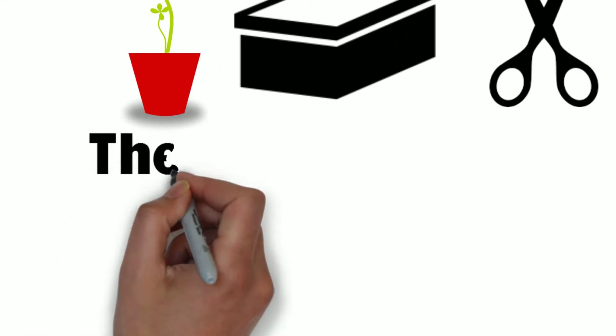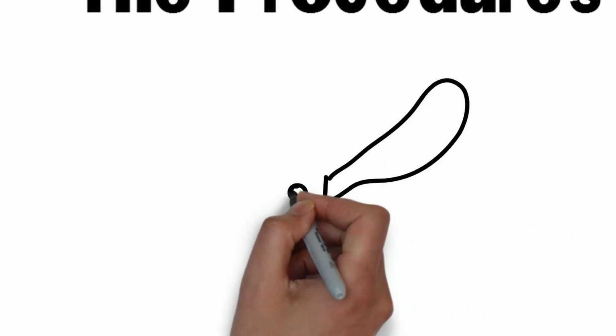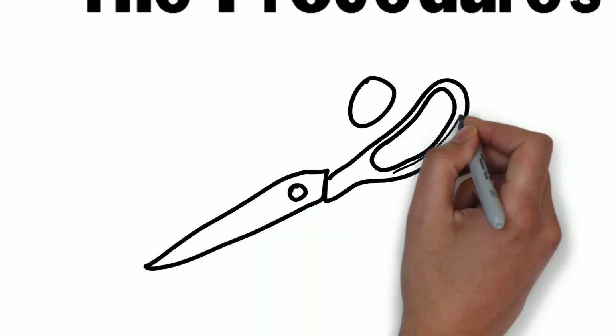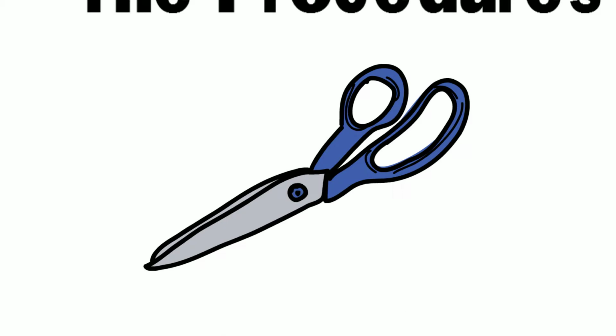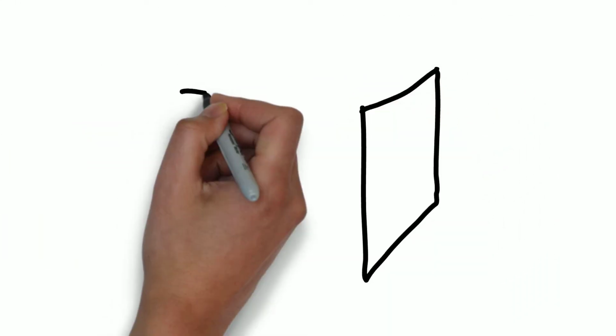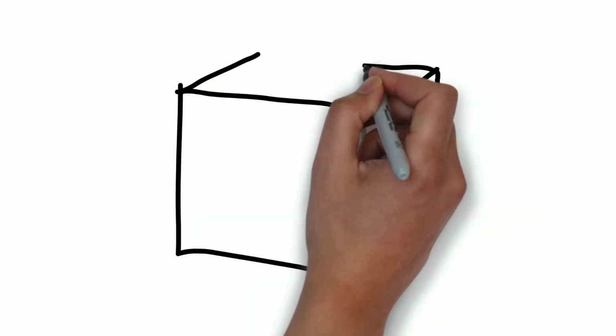For the procedures, the first step is to cut out a large hole at one end of the shoebox. Hold the box up to the light and be sure to tape up any other spaces where light could shine through. Then, cut 2 pieces of cardboard in the following sizes. Make both pieces half the width of the shoebox, then make both pieces the same height as the shoebox.